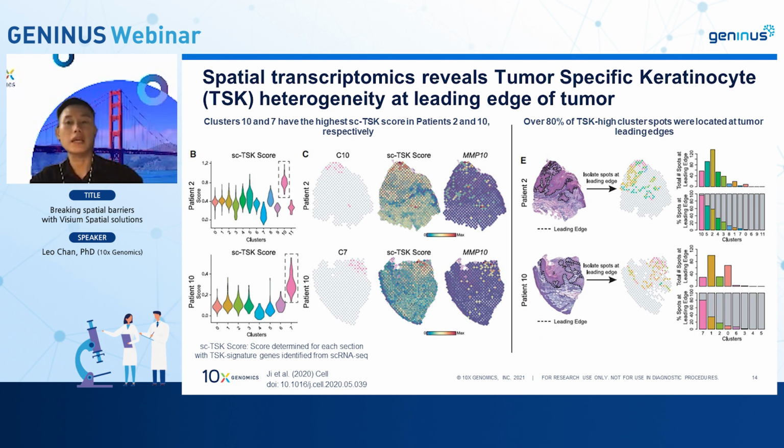All of these play important roles in tumor progression. Taken together, their data define the cellular composition and architecture of cutaneous squamous cell carcinoma. They examine the spatial niches where they interact from the spatial data, and they also examine the communicating gene networks that they engage in cancer.